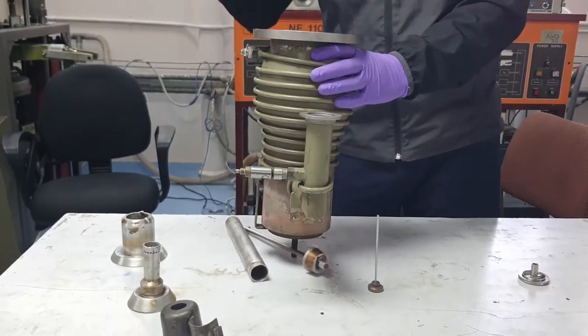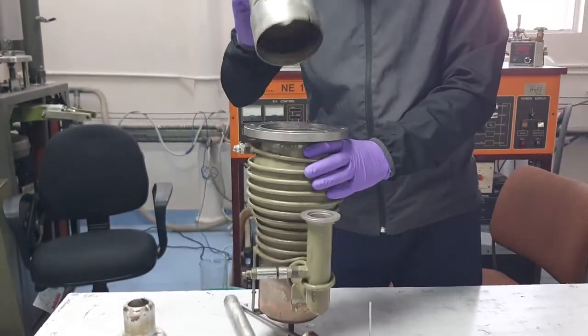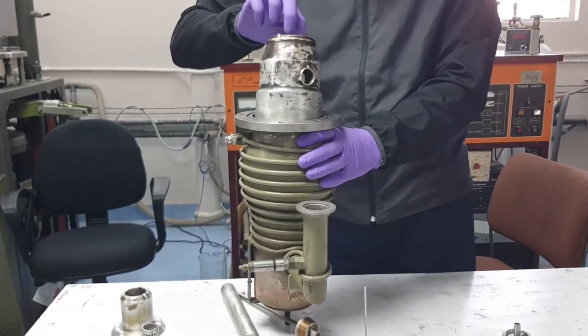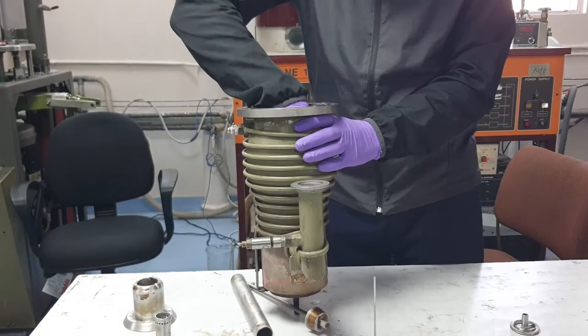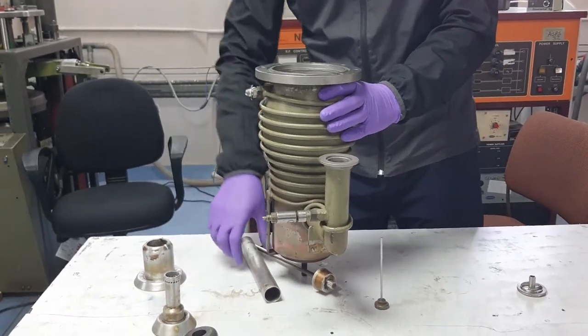Now we are going to assemble the jet assembly inside this casing. We need to make sure that this hole should be in line with this foreline port. This is the very first part, and then after, the second one.